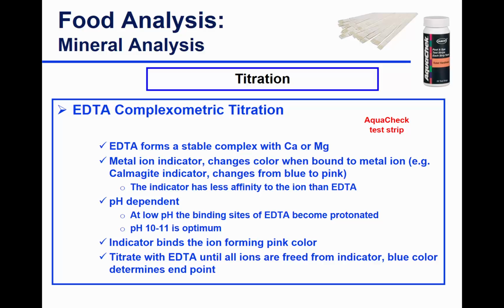And the strips function the same way. They are impregnated with magnesium and EDTA, and then when you dip them in the solution, the EDTA picks up the calcium, and then the indicator changes color.